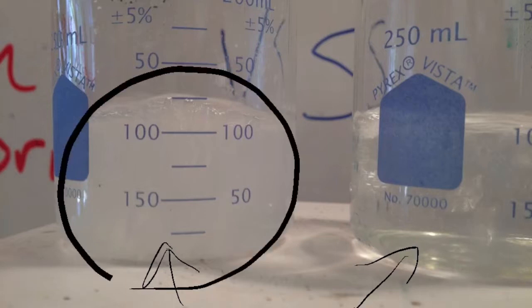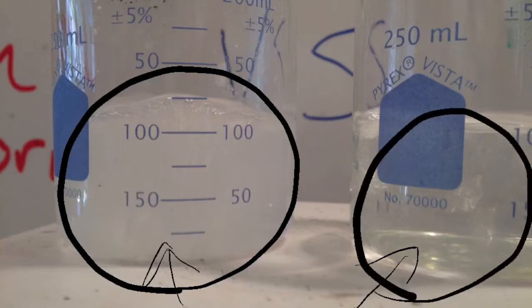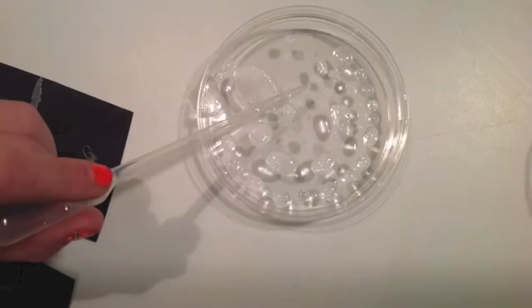The one on the left, the sodium chloride, is very close to being supersaturated. You're getting precipitation in the solution, which means even though it's boiling, the salt crystals are starting to form. So solids are forming in the solution. That's what precipitation means. It means when solids begin to form in solution. On the other side, you can see that the water is still fairly clear. So you probably want to add a little more of the magnesium sulfate to see what happens.